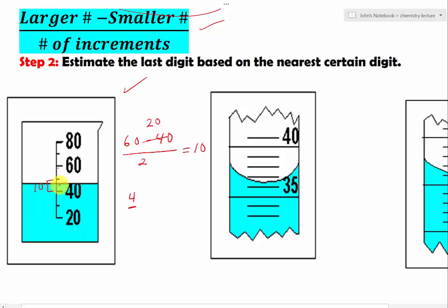See right there, we do not have a mark to tell us 40 something. So we have to estimate it. In this case, it's going to pass half a little bit. I would say about 46.